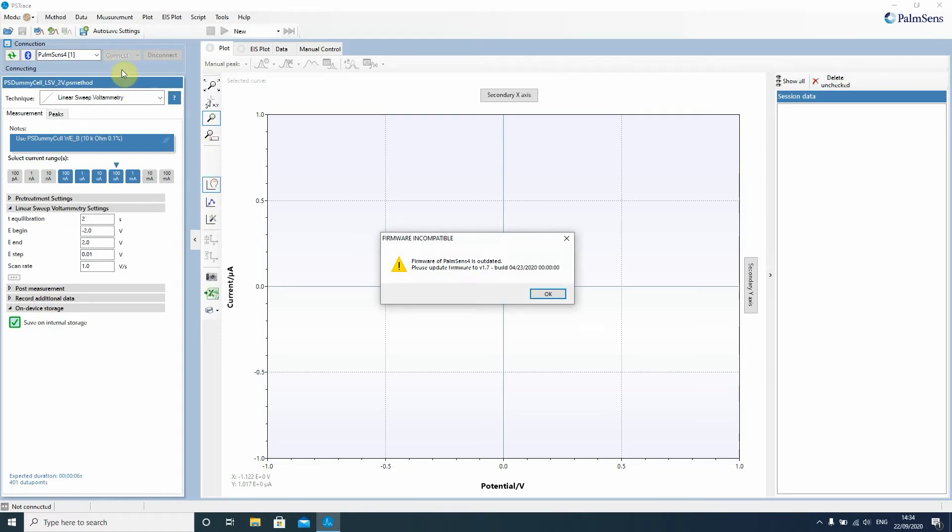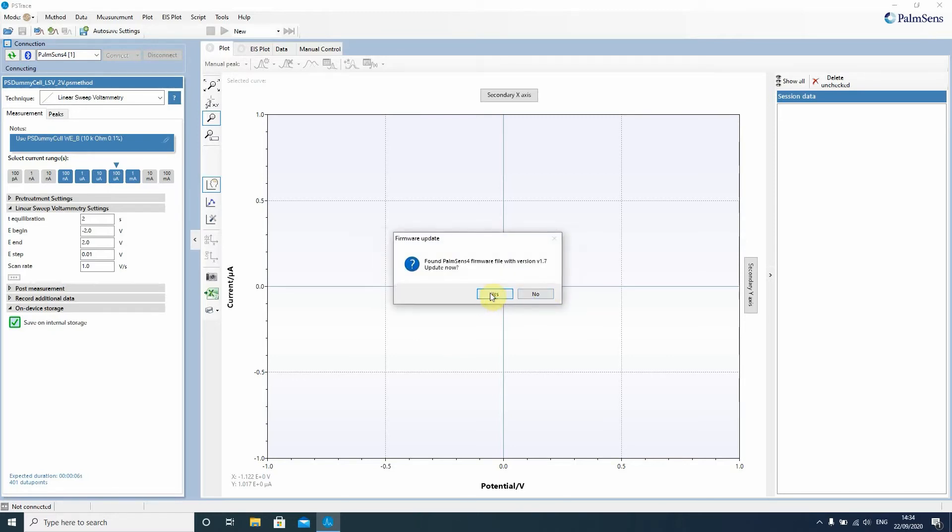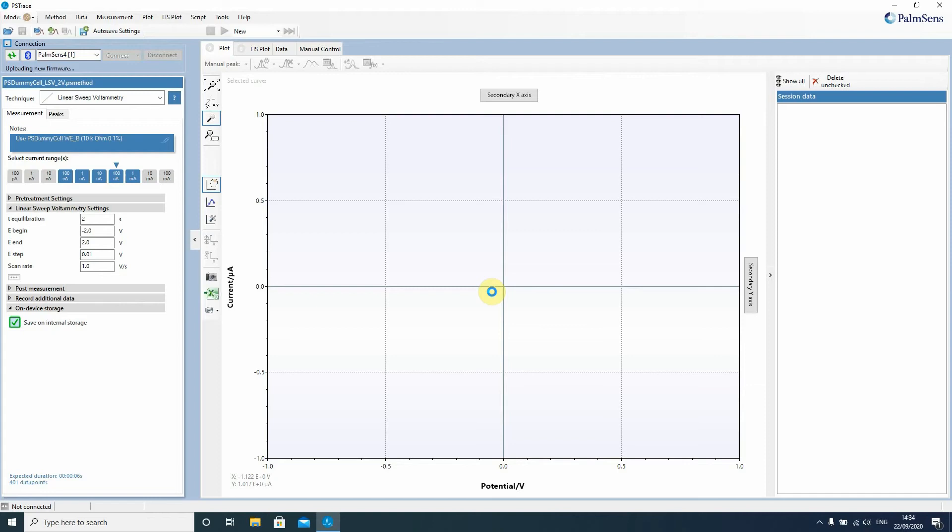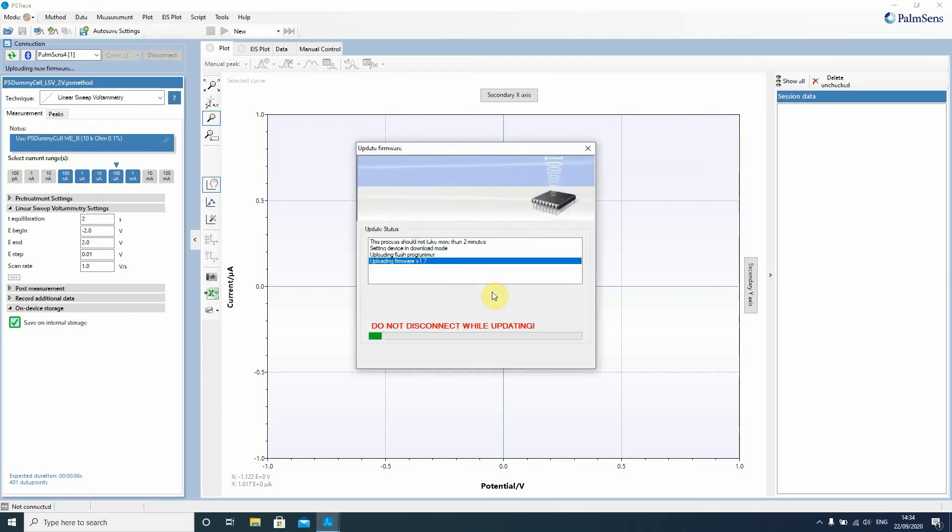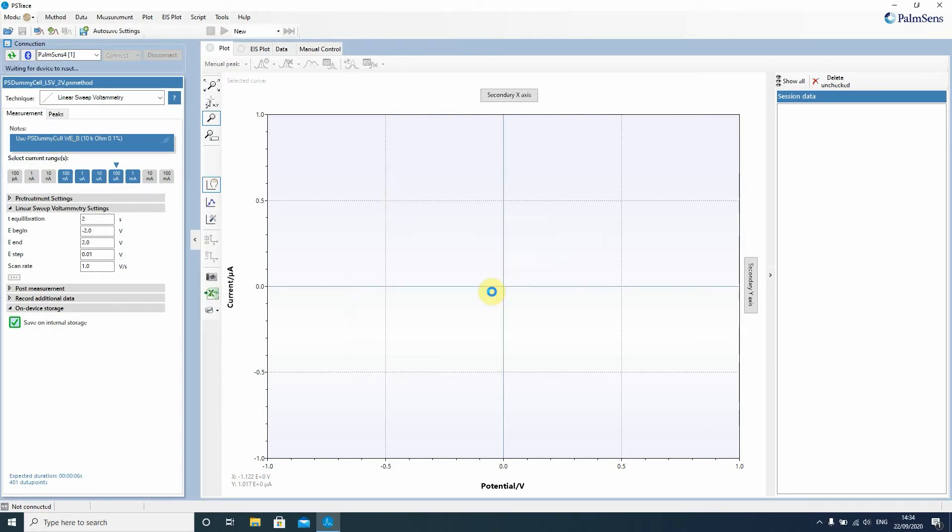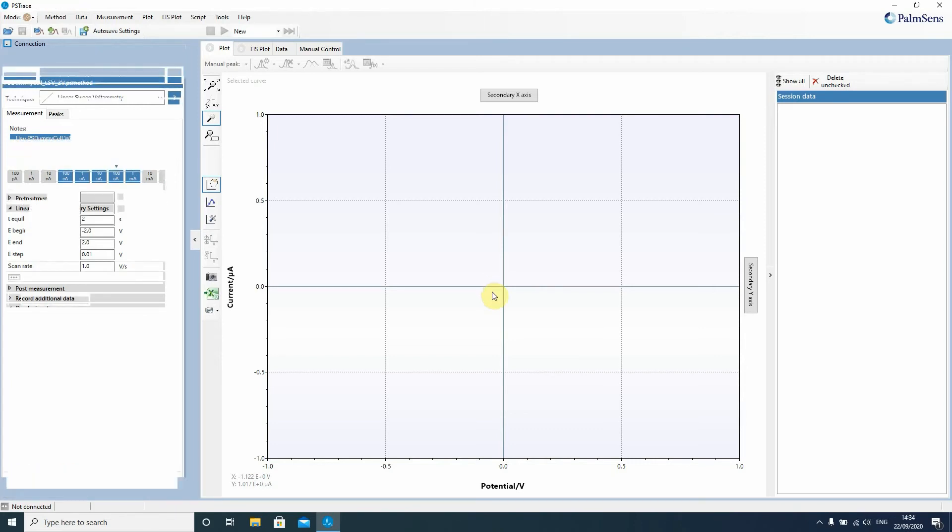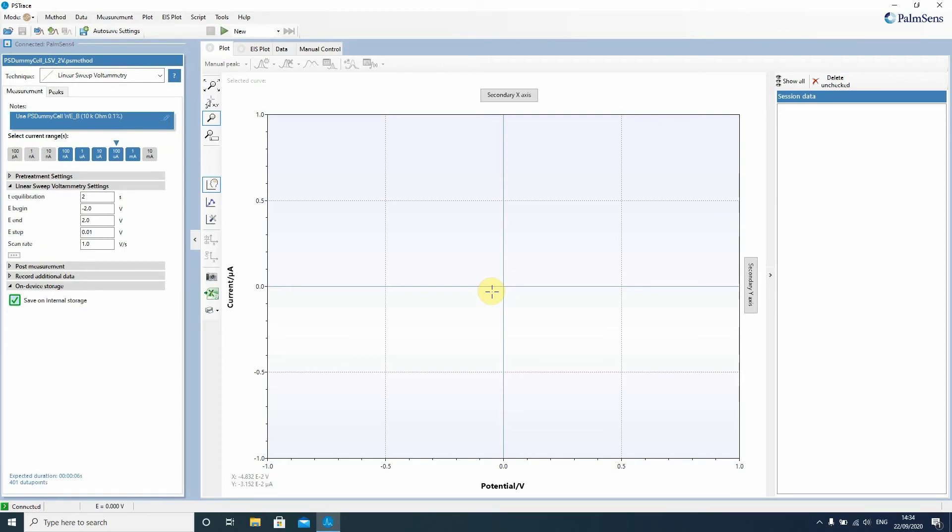Then you press connect and if you get this message that means PS Trace would like to upgrade your firmware. So you just press OK and say yes you would like to do that and then everything goes automatically. You just wait till the Palm Sense 4 shows again the standby screen that you have just seen. You see the progress bar and it already reboots. You just need to wait and then PS Trace is automatically reconnecting to the Palm Sense 4 that you've just tried to connect to.